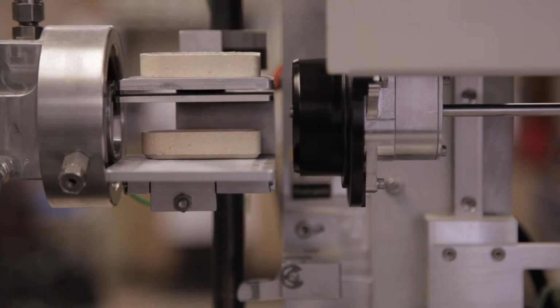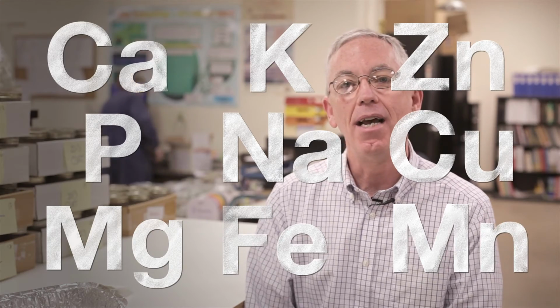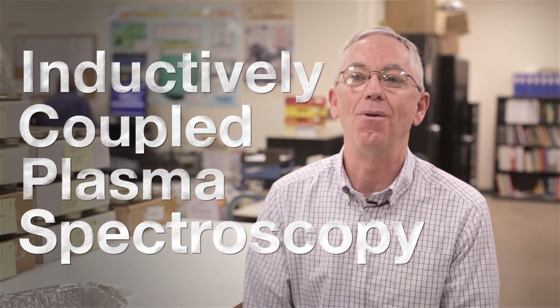The second half of the analysis is the elemental analysis. We're looking at the calcium, phosphorus, magnesium, potassium, sodium, iron, zinc, copper, and manganese. And this is done by inductively coupled plasma spectroscopy, otherwise known as ICP.